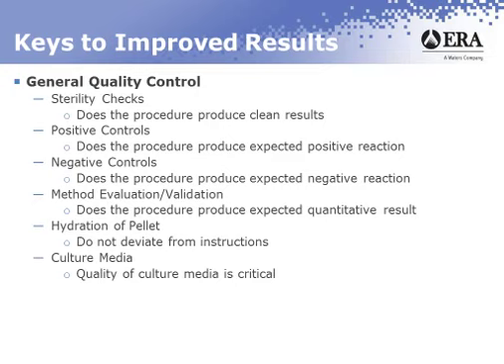You always want to evaluate the media before you put it into first use. You never want to use media outside of its expiration date. You never want to use media that hasn't been stored according to the manufacturer's specifications. If they store it out of the light at ambient temperature, you need to do that.